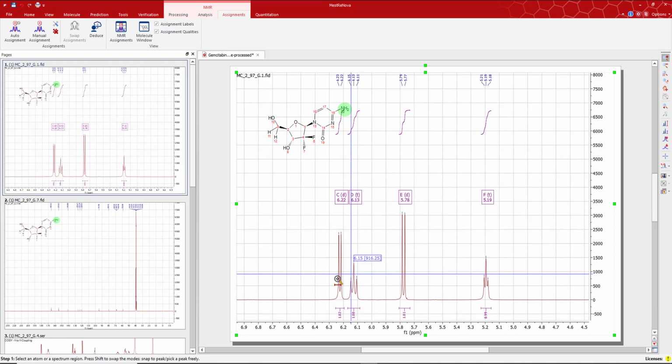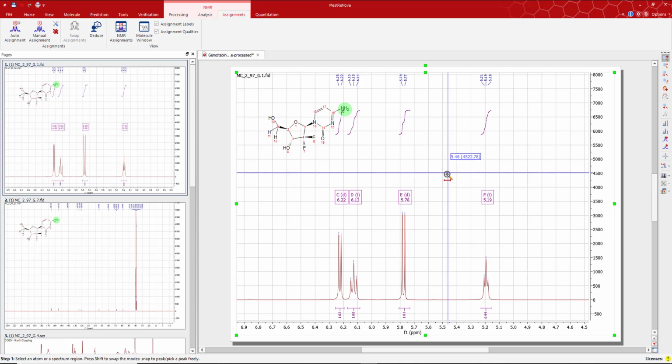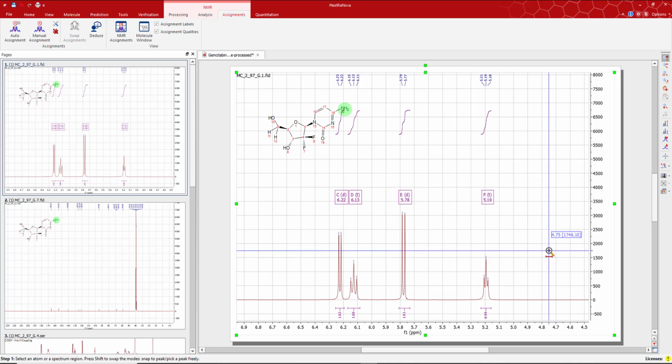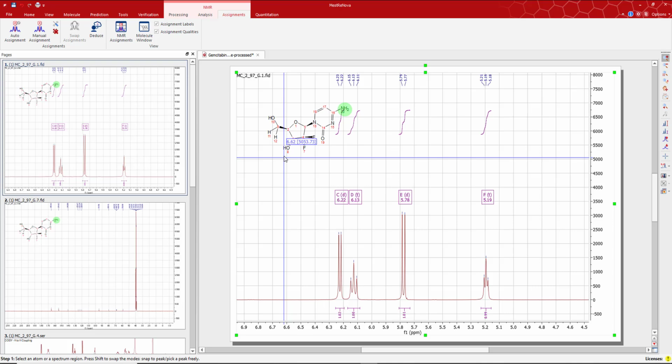And you may notice that I actually have coupling to my heteroatoms, and the reason for that is that this was taken in really dry DMSO, so there's no water around here, there's no proton exchange with the solvent, so I'm actually seeing coupling to and from my heteroatom protons. So that means that since we see the coupling, we can already fairly confidently assign which of these is which. So a triplet here would be my OH with two neighbors, likely that one. The doublet here would be my OH with one neighbor, likely this one, number 8.